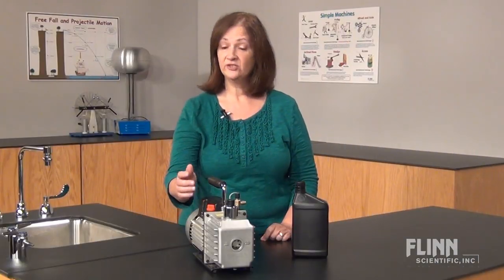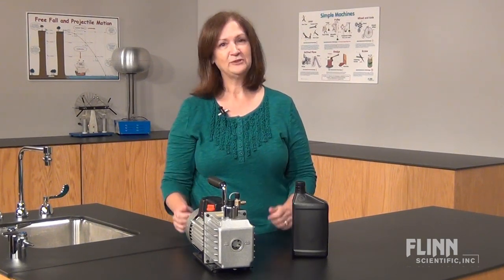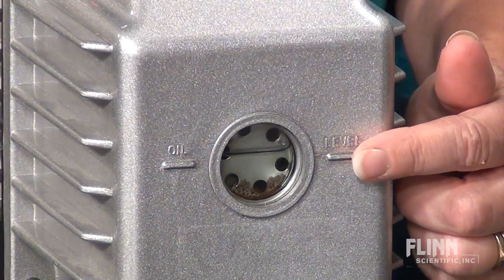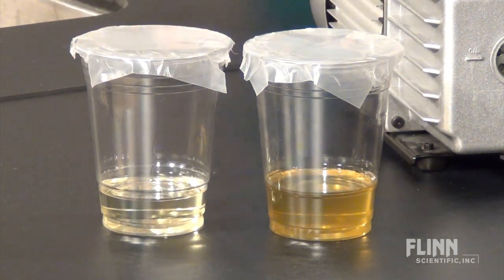How often you need to change the oil depends on what type of chemicals the system's been exposed to and how often you use the pump. Since you can't tell the condition of the oil by looking through the oil level window, drain a little into a clear plastic cup. It's a good idea to have fresh oil on hand for comparison.